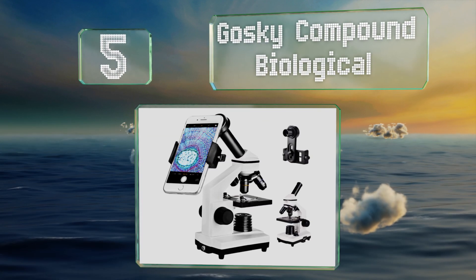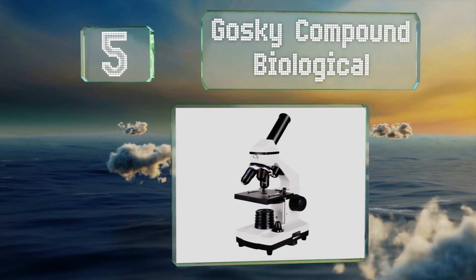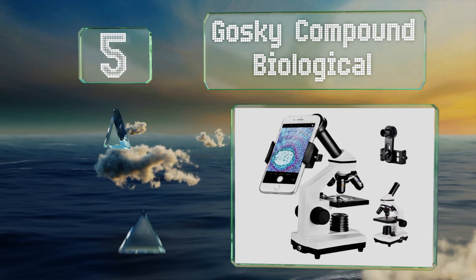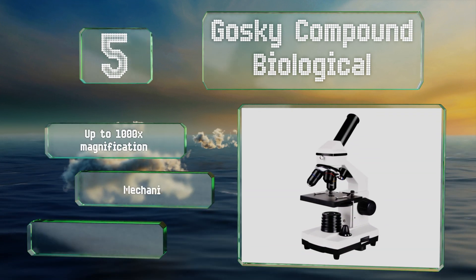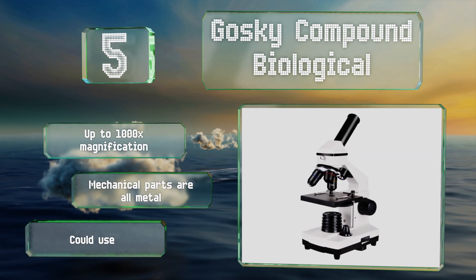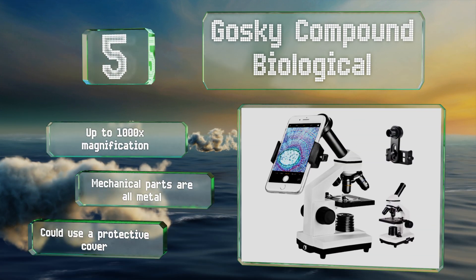Coming in at number five, the Goski Compound Biological is a great choice for teaching young learners as it incorporates the one thing they couldn't live without — their smartphone. It features a handy mount that leverages the phone's camera to display a specimen on its screen. It delivers up to 1000 times magnification and the mechanical parts are all metal.